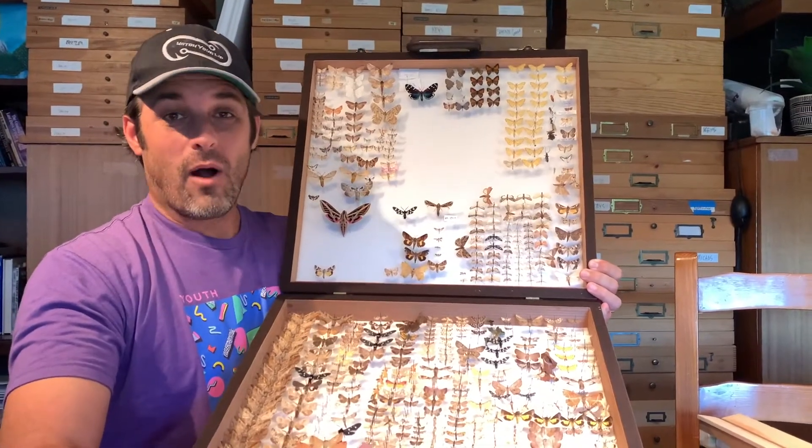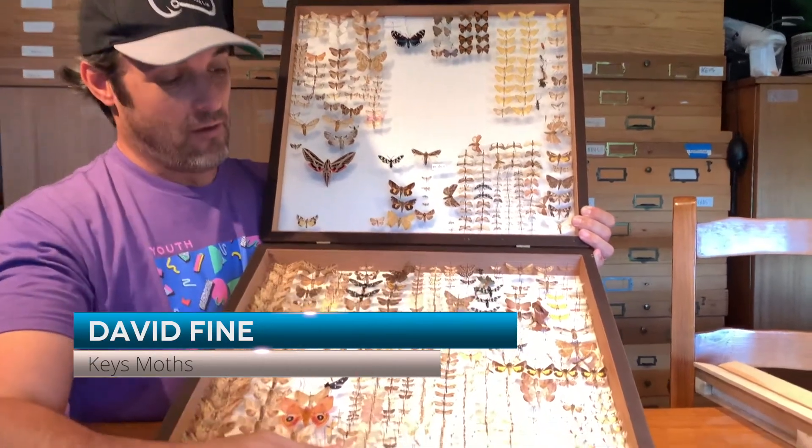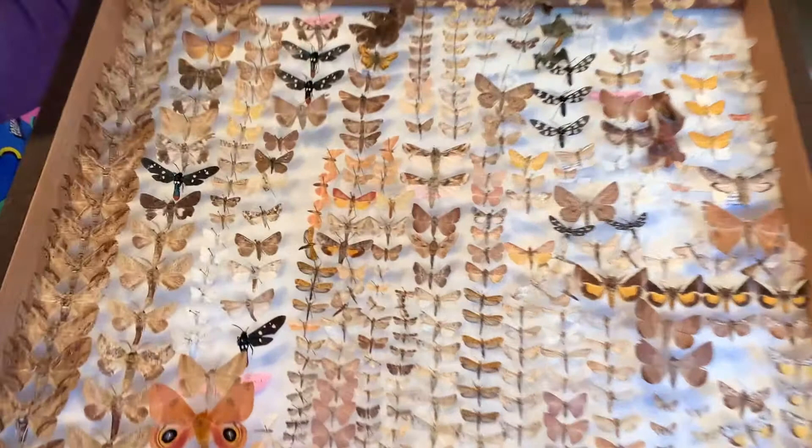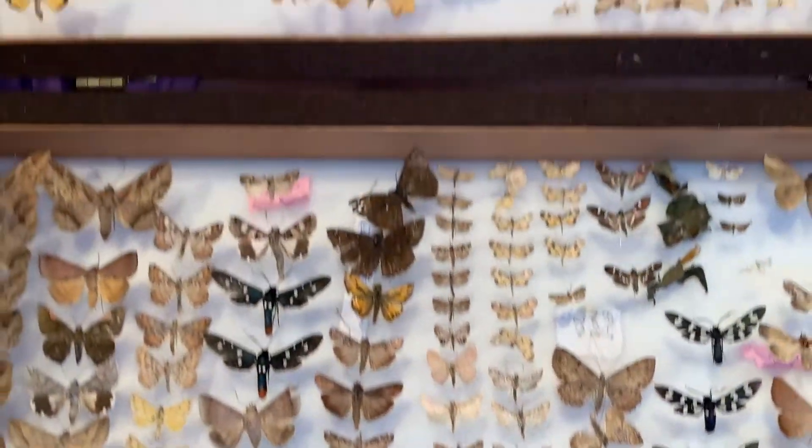Hi folks, this is David Fine. Welcome to Keys Moths. What I hold in my hand right now is a box of moths that I have collected in the Florida Keys.